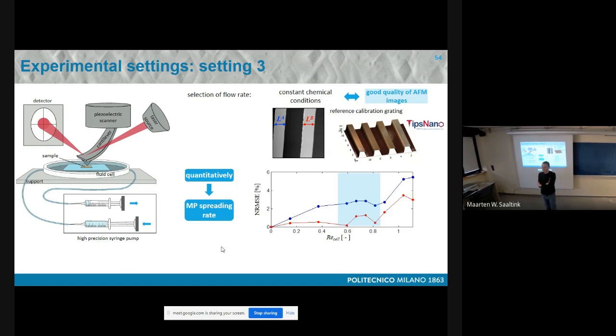So you're happy with the resolution? For the moment, I'm happy. You mentioned 10 nanometers. No, 10 micrometers. No, sorry, I misunderstood you. No, 10 nanometers. Okay, so you must use atomic force. No, you can do it with interferometry to the same resolution.